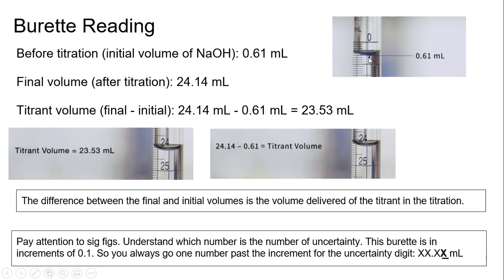Here's a hint. That might be a question for some of you. Do not pick 0. I don't know why I actually start my labs at 0, because it makes sense to have it at 0, because you don't have to go through this. Everything will always be final volume minus 0, but they do not want that, so make sure you follow their rules to get the points.